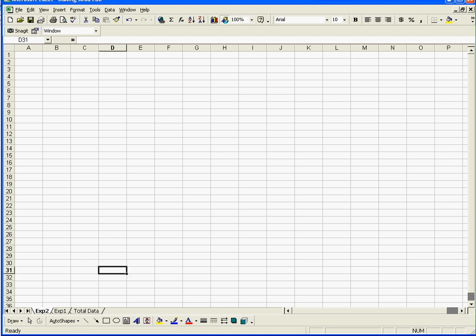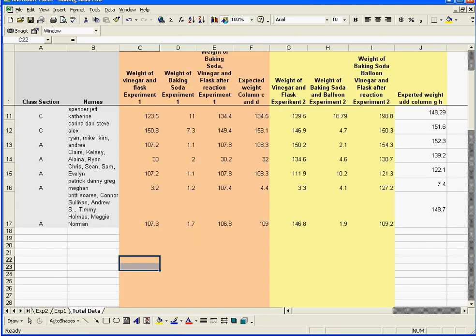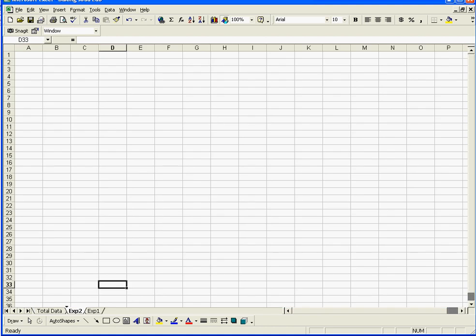Now, one thing you should be aware of is I am a little anal, and I want the total data to be first, so I'm going to click here on this tab and drag it over so it comes first. And then this is Experiment 2, I'm going to drag it over here, and there it is.